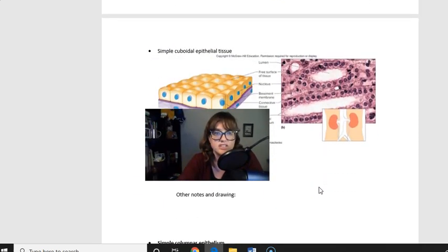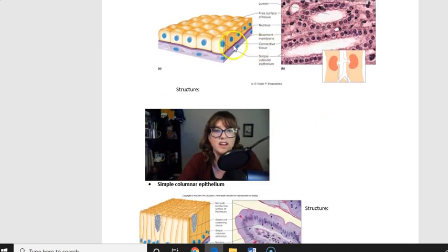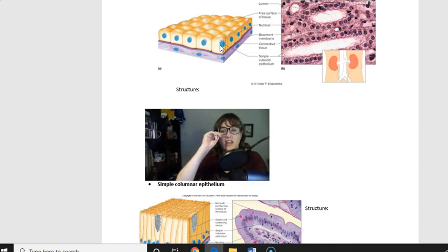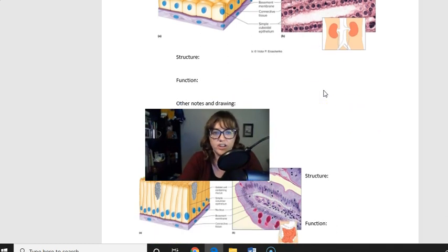So you'll see it goes on from squamous to the cuboidal. Guess what? They look like cubes. We're going to talk about what happens between these cells in lecture 5. You will notice that lecture 5 diverts a bit from the lab. There's no good overlap in the way our schedule works for them to be the same thing. That happens a little bit. It's all good. It's going to be fine.